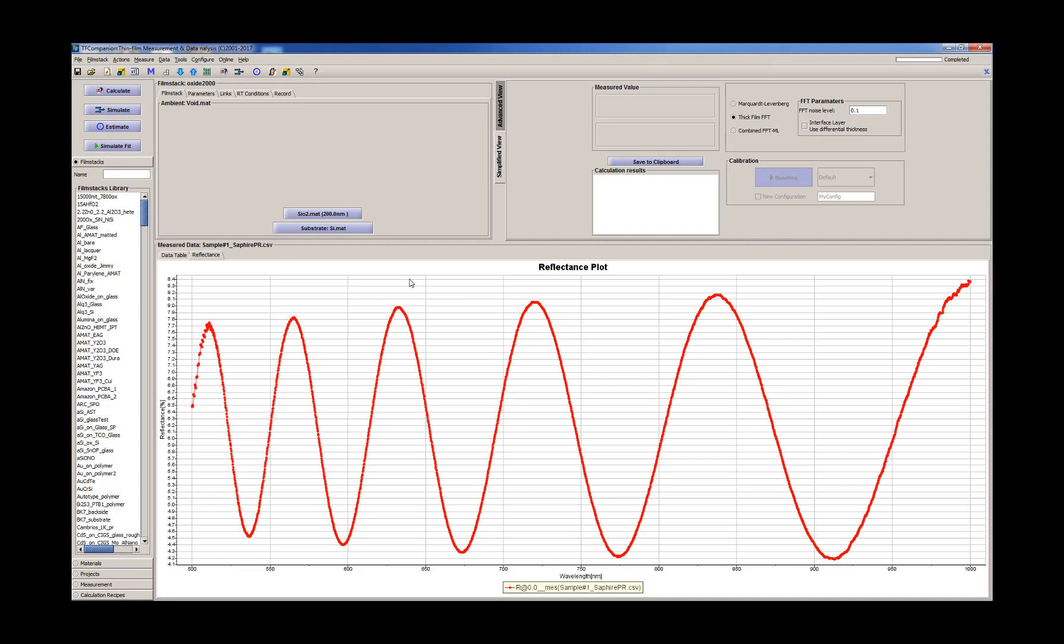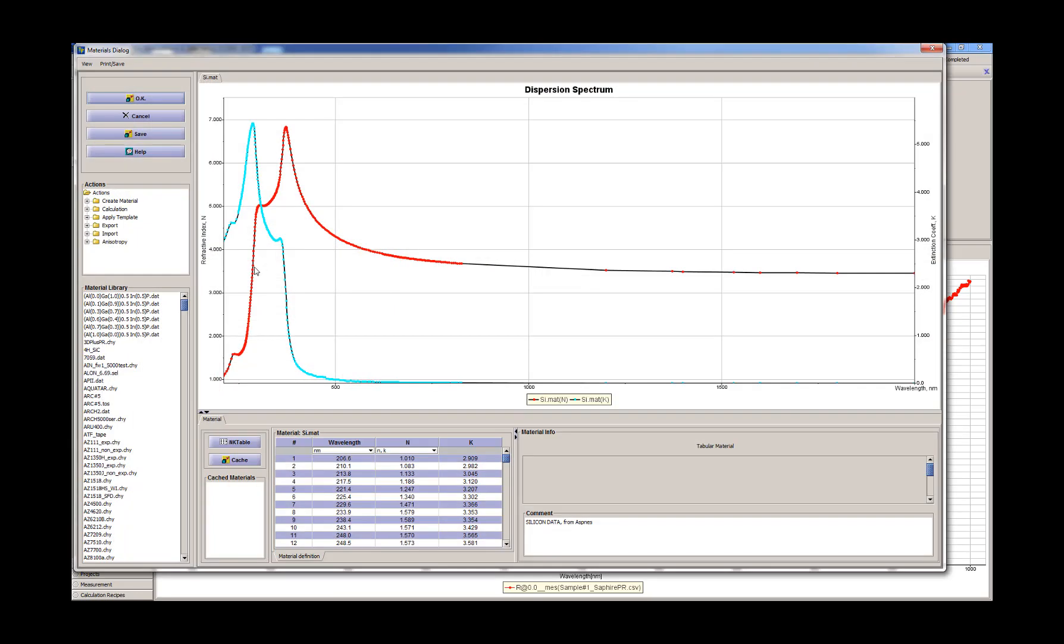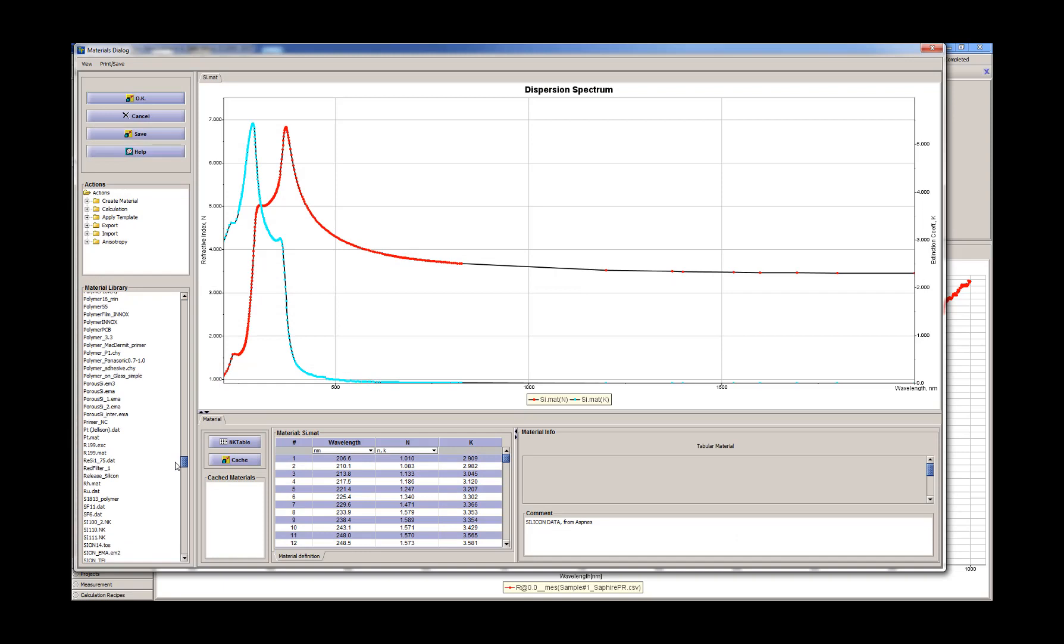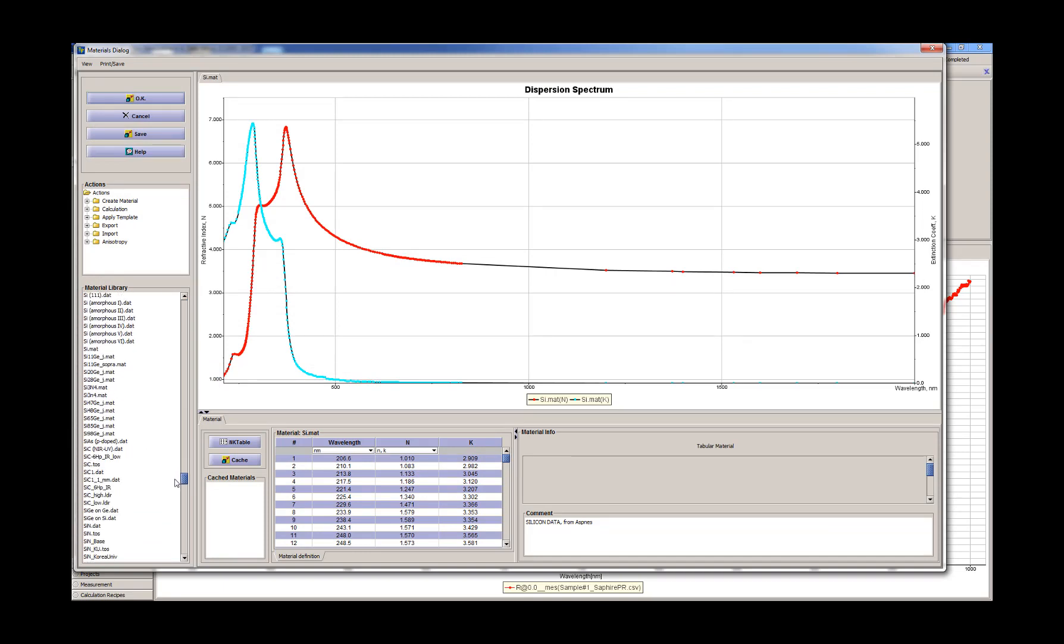Now we need to first build the approximate film stack that represents the sample. The substrate is sapphire, so we'll select the sapphire material here. Here is sapphire.